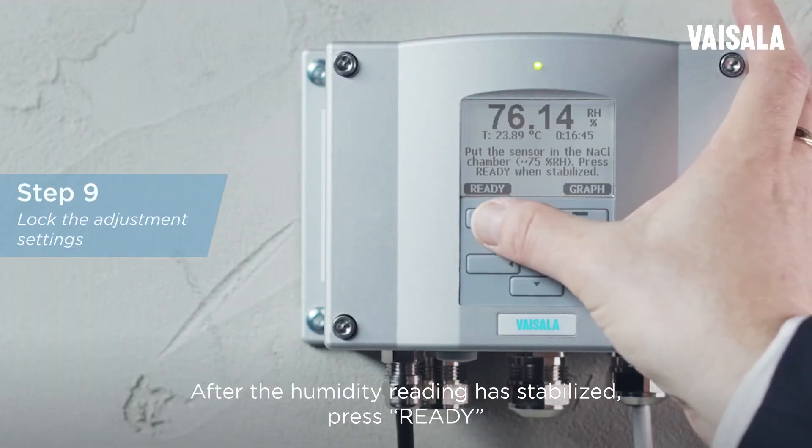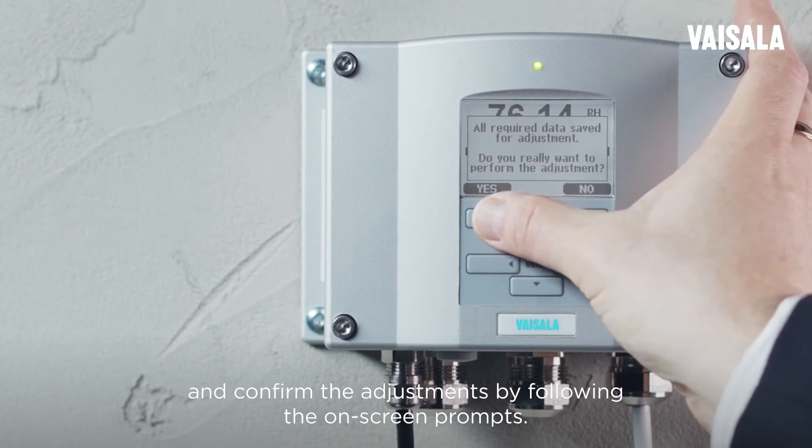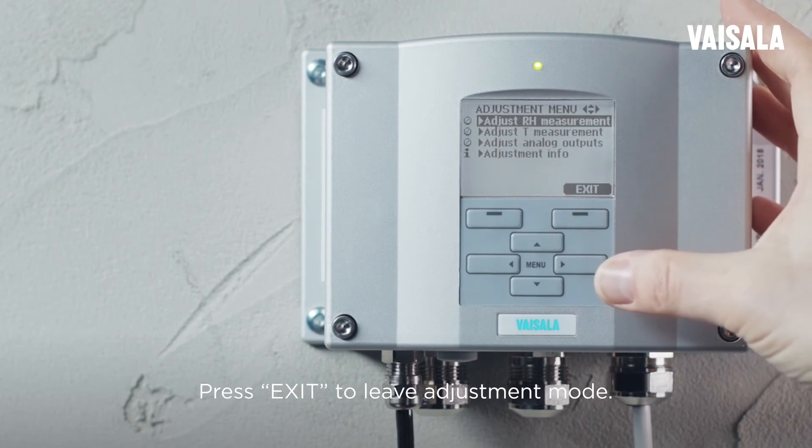After the humidity reading has stabilized, press READY and confirm the adjustment by following the on-screen prompts. With other instruments, you might need to check the sodium chloride reference value from Greenspan's calibration table. Press EXIT to leave adjustment mode.